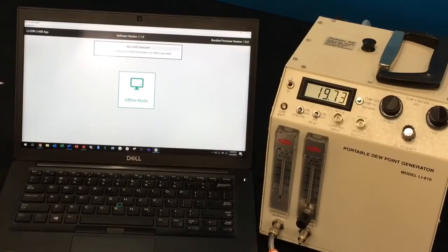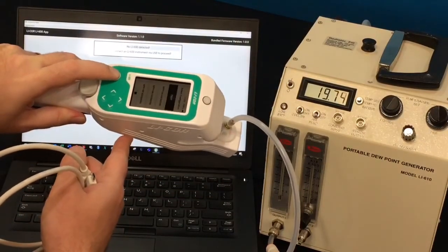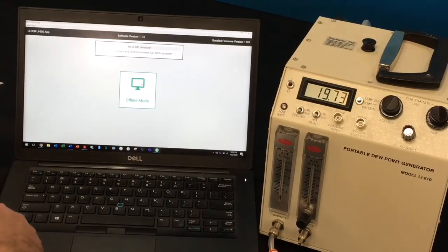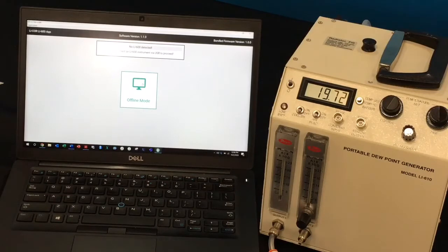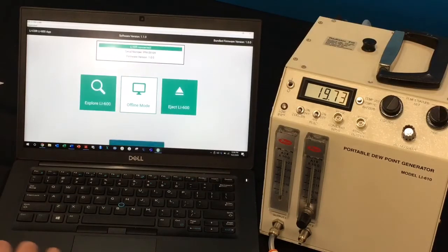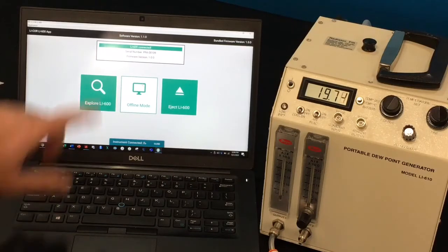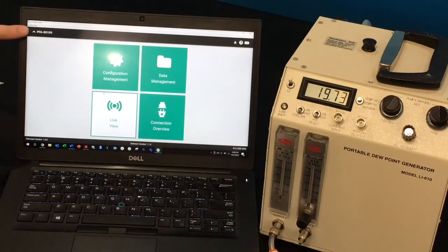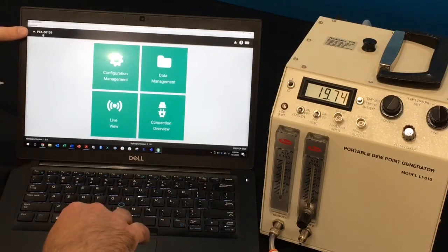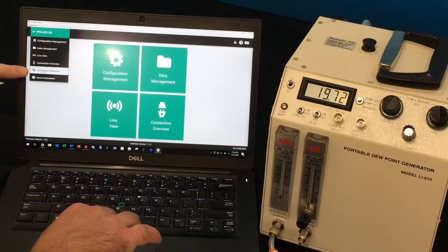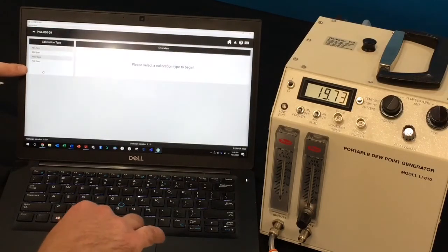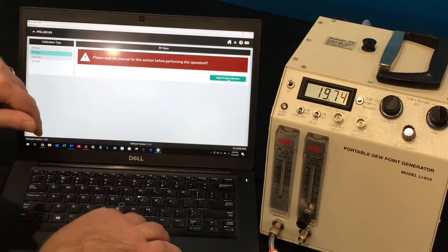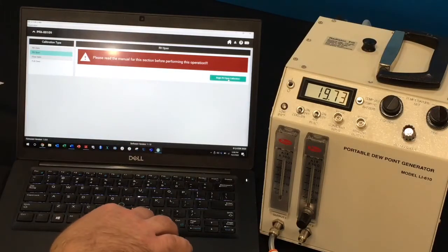Next to perform the span we'll need to turn the LI-600 on and connect it with USB to the computer. The LI-600 Windows or Mac software will automatically recognize when the instrument is connected. We'll go to explore LI-600 and then in the top left corner there's a menu with the instrument serial number. If you click on that we'll go down to instrument calibration and we'll want to select RH span. It says please read the manual or watch this video and then we can begin RH span calibration here.